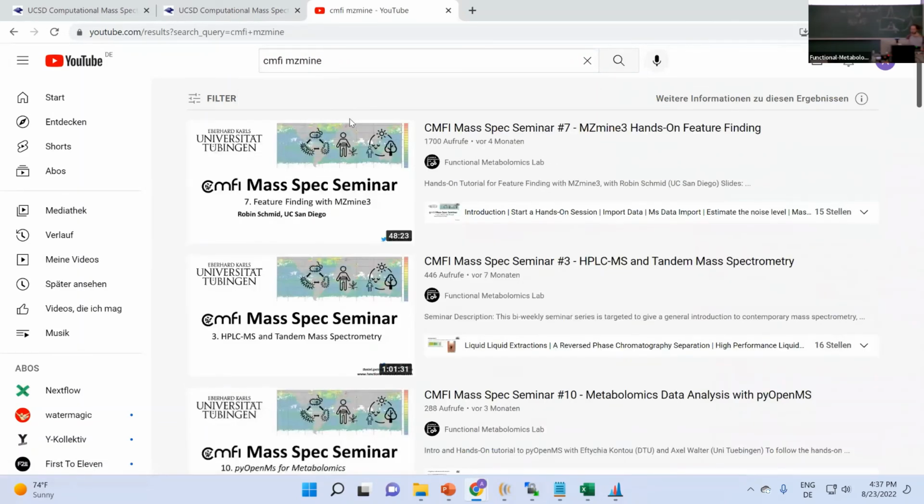Feel free to ask. Yeah, we did not suppress the blank. Is it possible to do it? Yes, we do have something: if you also run the feature detection on your blank samples, you can subtract them. So subtract the features that were detected in the blank from everything else.